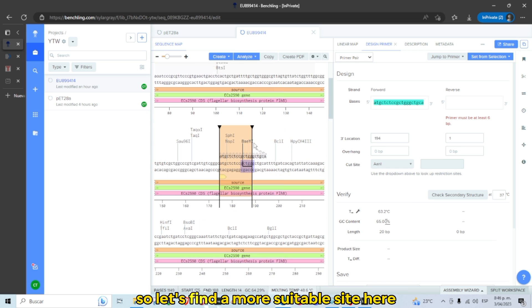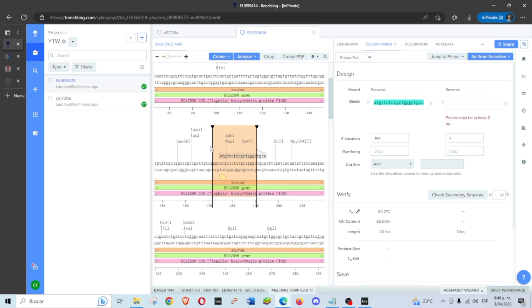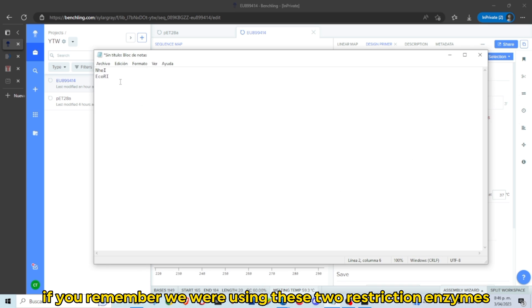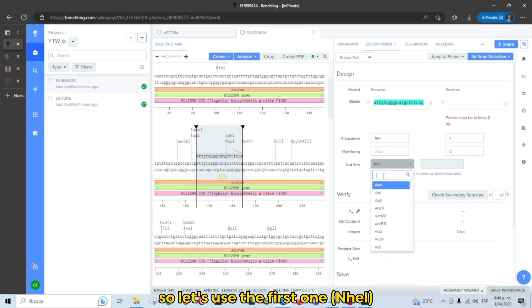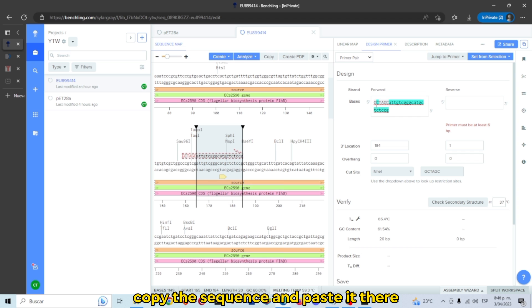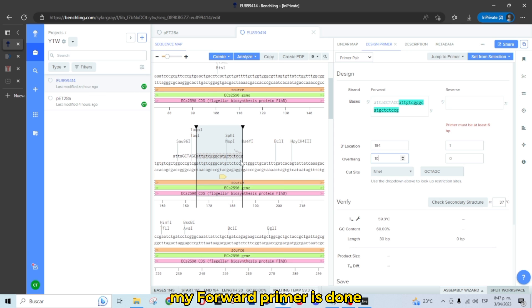Another thing to consider is the 3' GC clamp at the end of the primer, so let's find a more suitable site. Select from selection, Forward. As you can see, the GC content is 60%. We were using two restriction enzymes, so let's use the first one — NHE1. Copy the sequence and paste it there. We need to add a short sequence — any nucleotides, 4 to 5 — and increase the overhang. The forward primer is done.